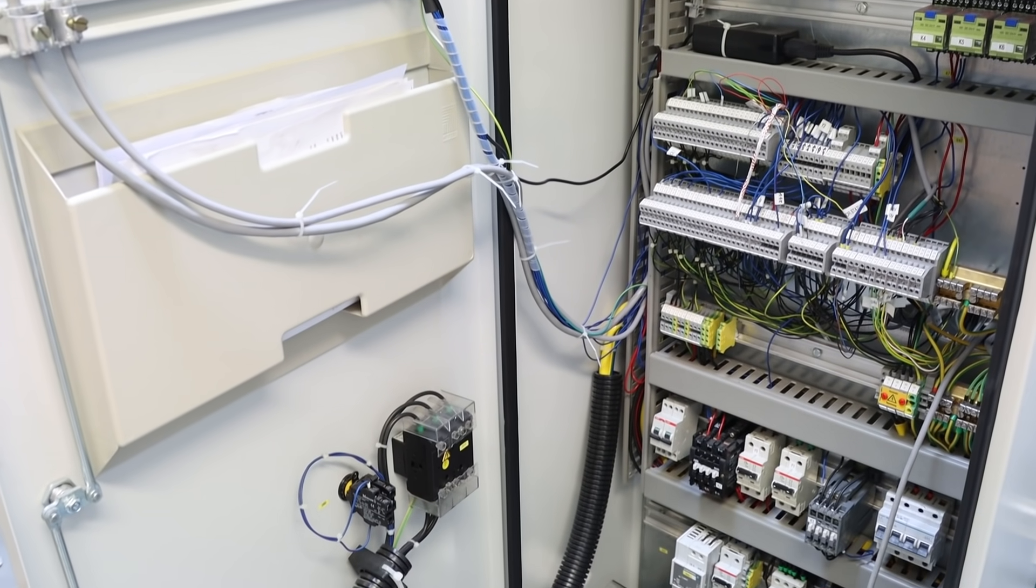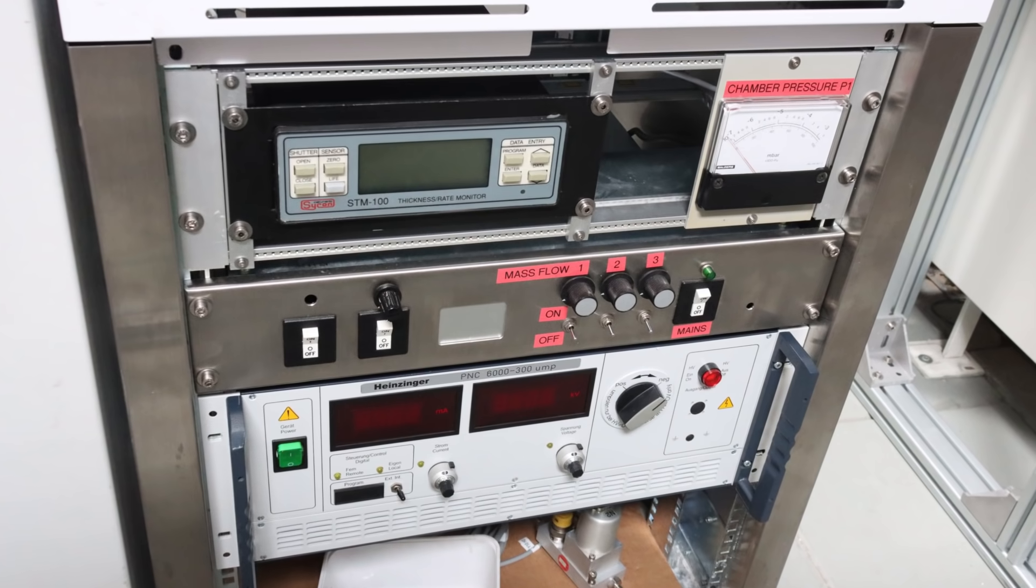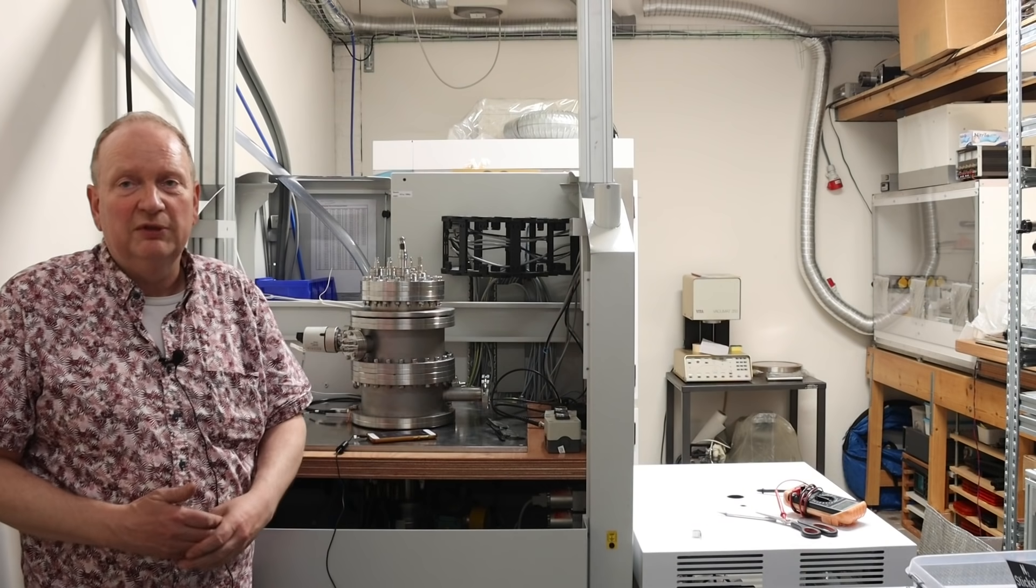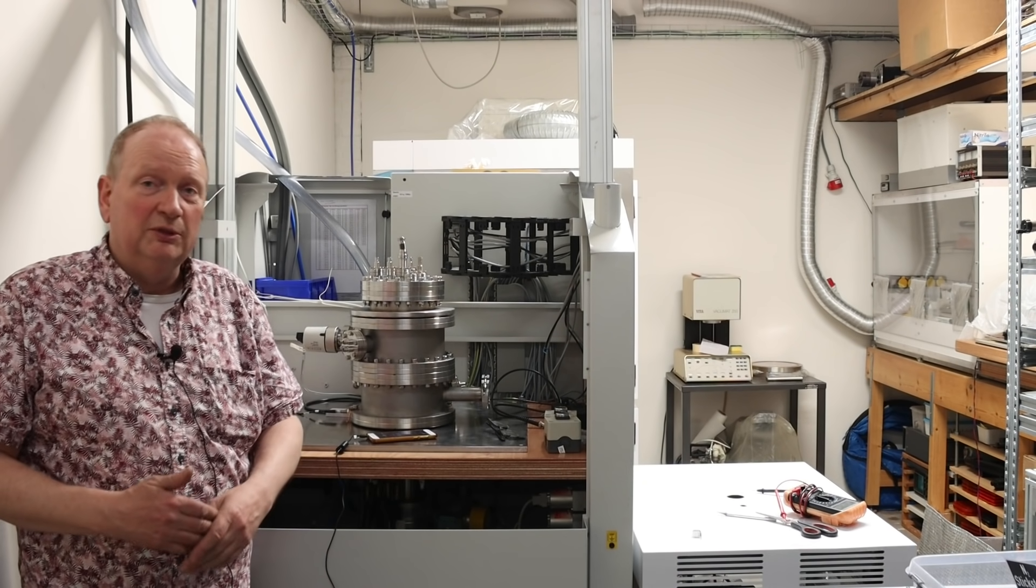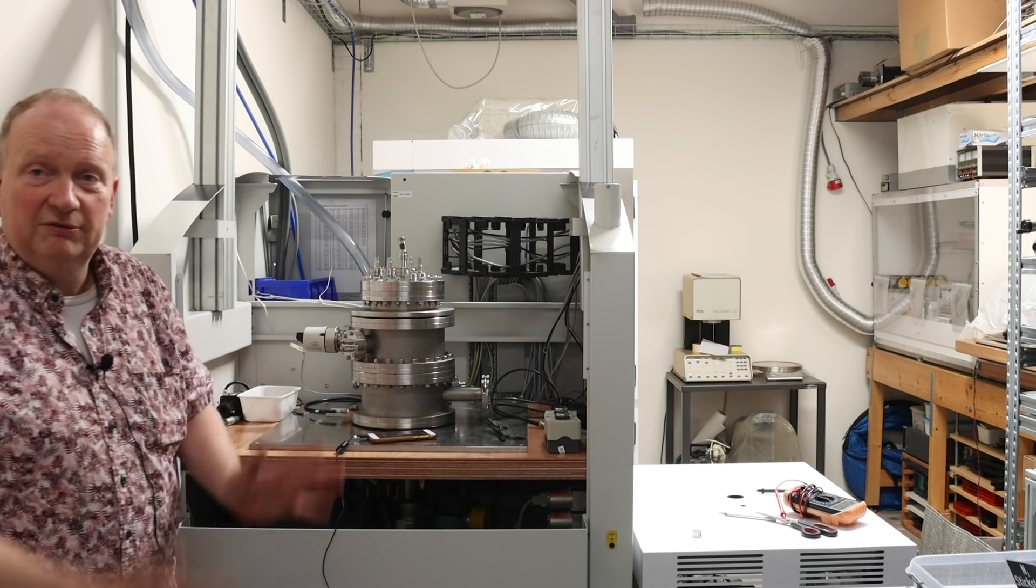I can't really go into every nitty gritty detail here, but I will just stick to the main subjects and show you around the machine, tell you a little bit about physical vapor deposition, and in the end hopefully we will also deposit a thin film. Let's just dive right in.